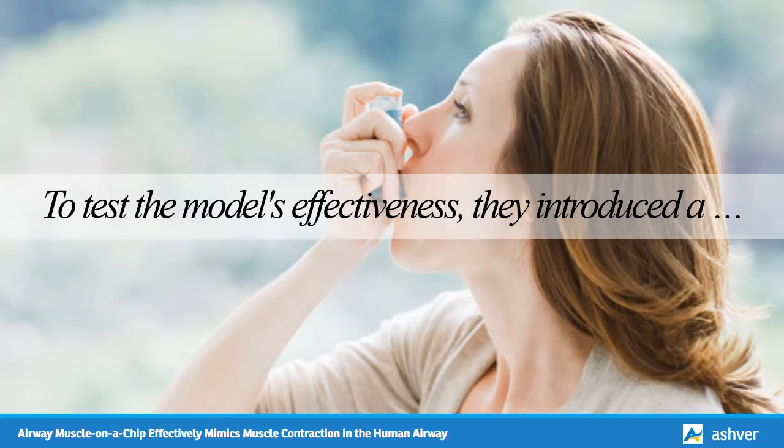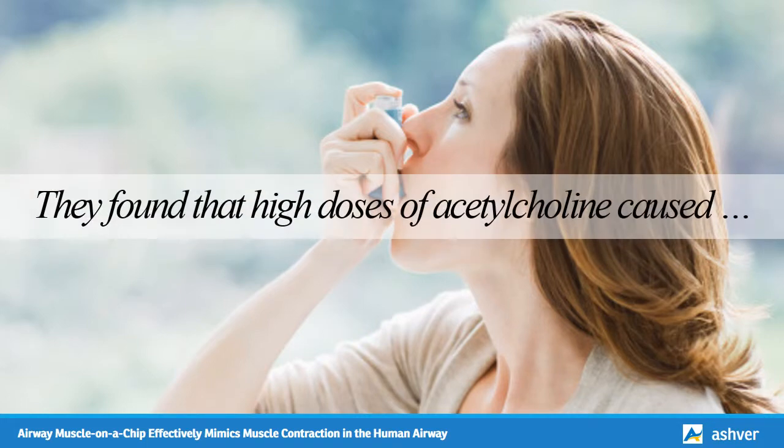To test the model's effectiveness, they introduced a protein called interleukin-13, IL-13, which is commonly found in the airway of patients with asthma. It is known to trigger the smooth muscle's response to allergens. The team then added a neurotransmitter called acetylcholine, which causes contraction of smooth muscle, to induce an allergic response. They found that high doses of acetylcholine caused the airway muscle on the chip to hypercontract. When the team introduced beta agonists to the chip, used in inhalers to reduce airway inflammation, the airway muscle relaxed.